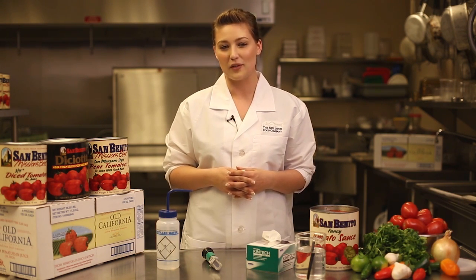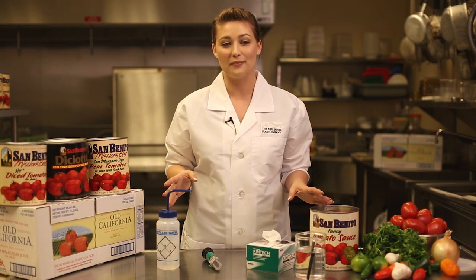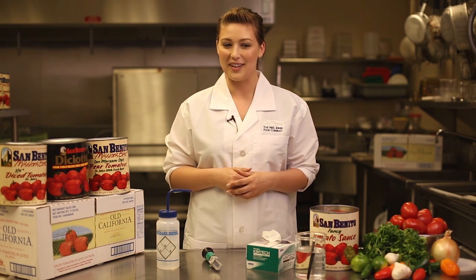Restaurant operators generally have a specific sweetness level that they target for various applications. We measure BRIX using a refractometer. Today I'm going to discuss with you what that is, how to properly use it, the types of products it can be used with, and how to properly take care of it.